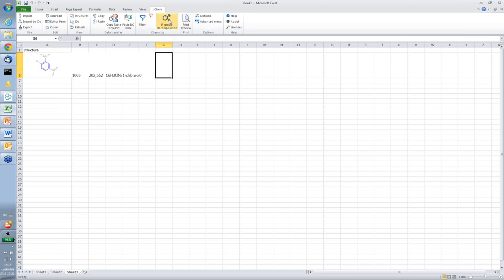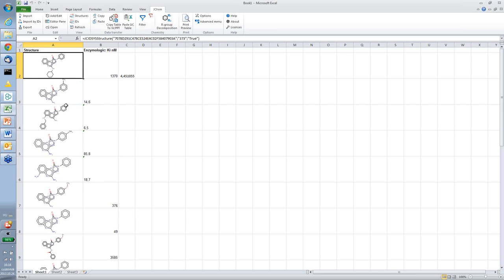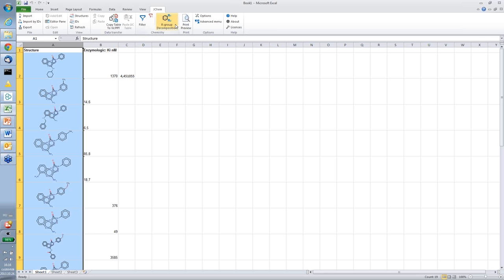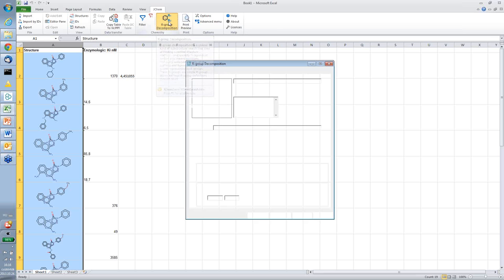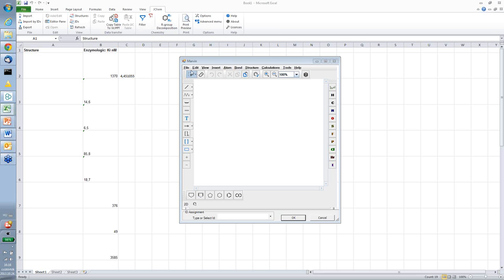Now let's move to another important chemistry feature of ours. It's common during drug research processes to do an SAR analysis, which involves R group decomposition of compound libraries. So let's say we have this compound library here, and we want to prepare an SAR analysis. First point is to do an R group decomposition. To do so, we'll define a scaffold.